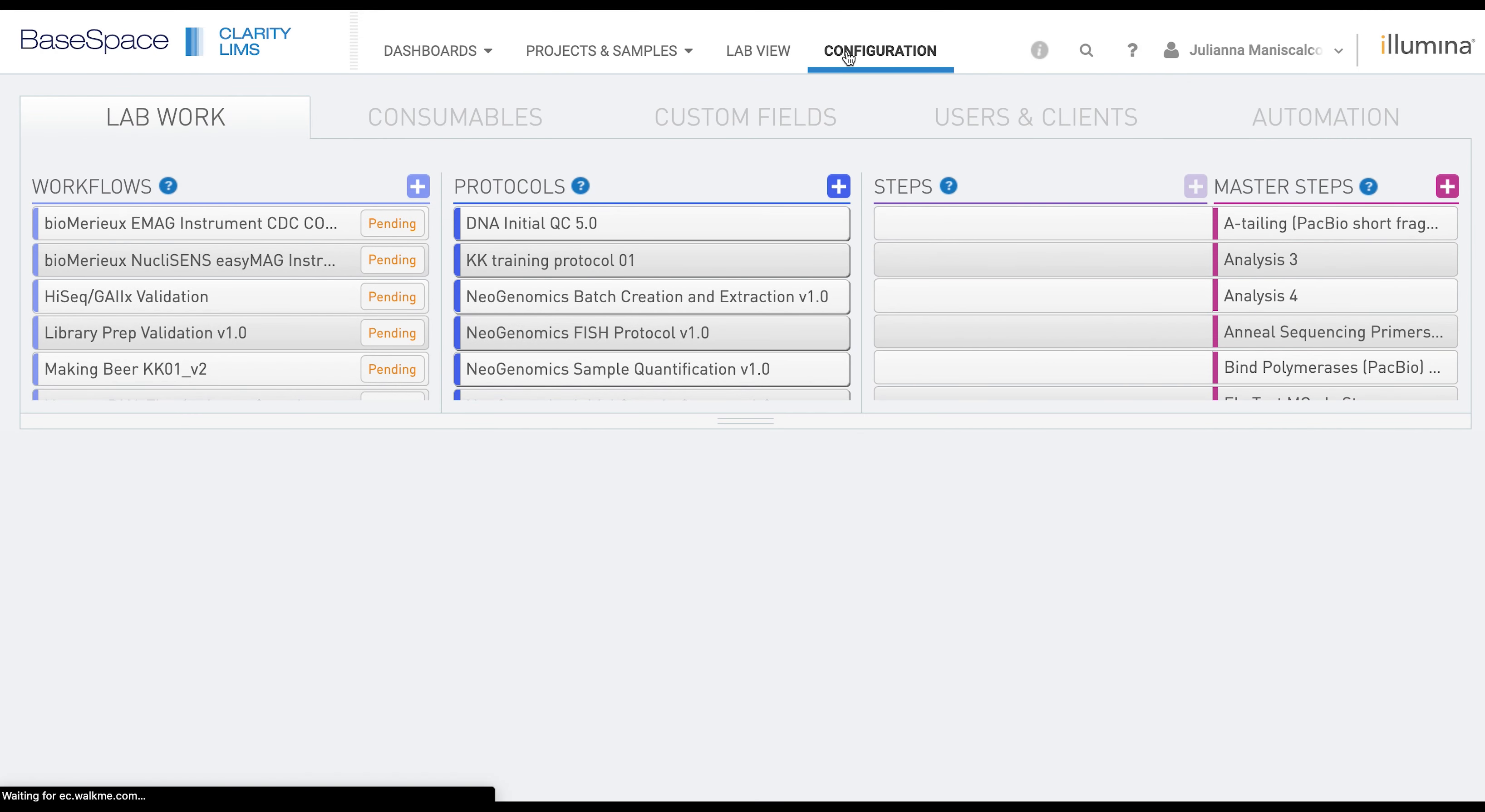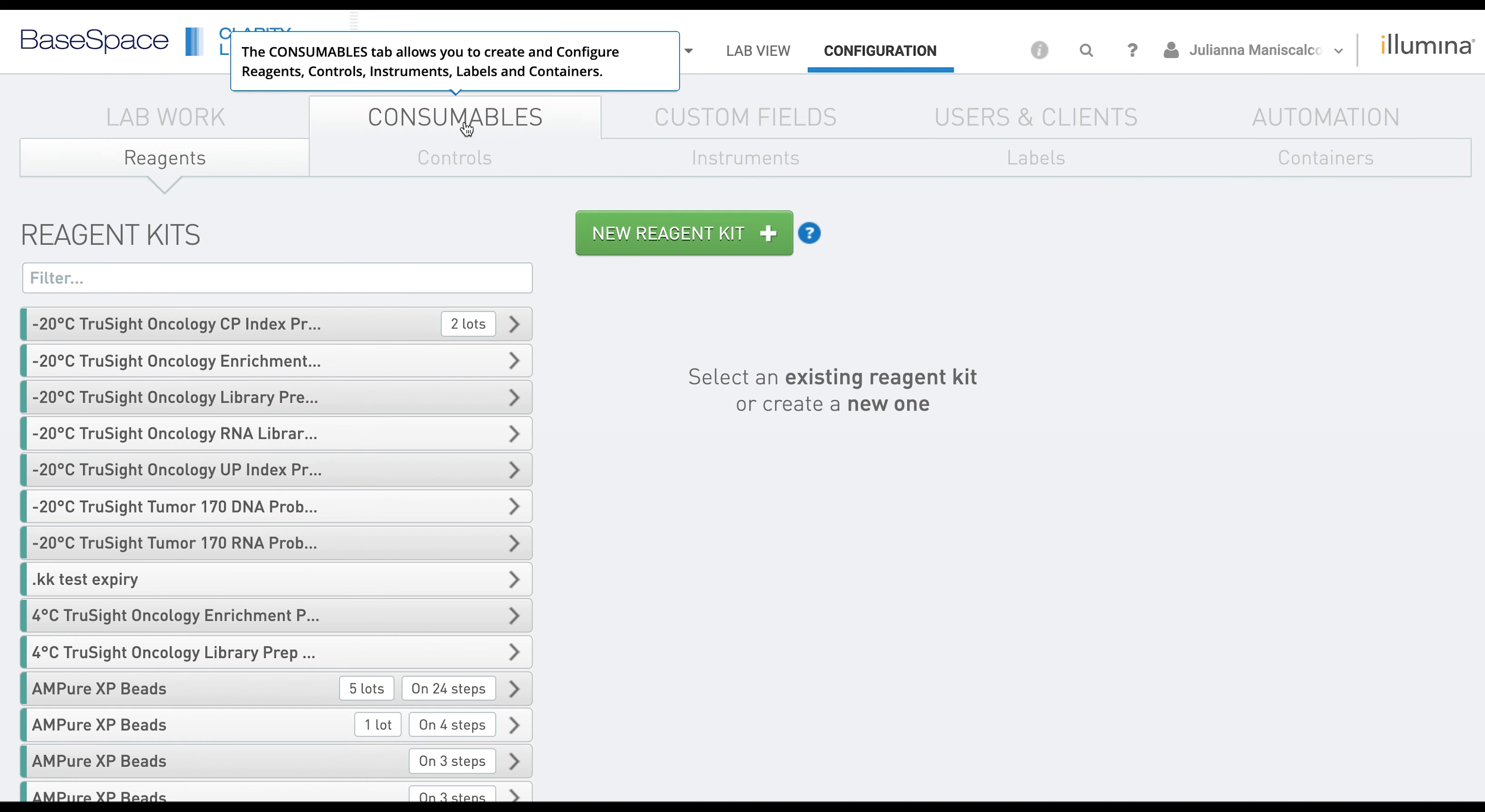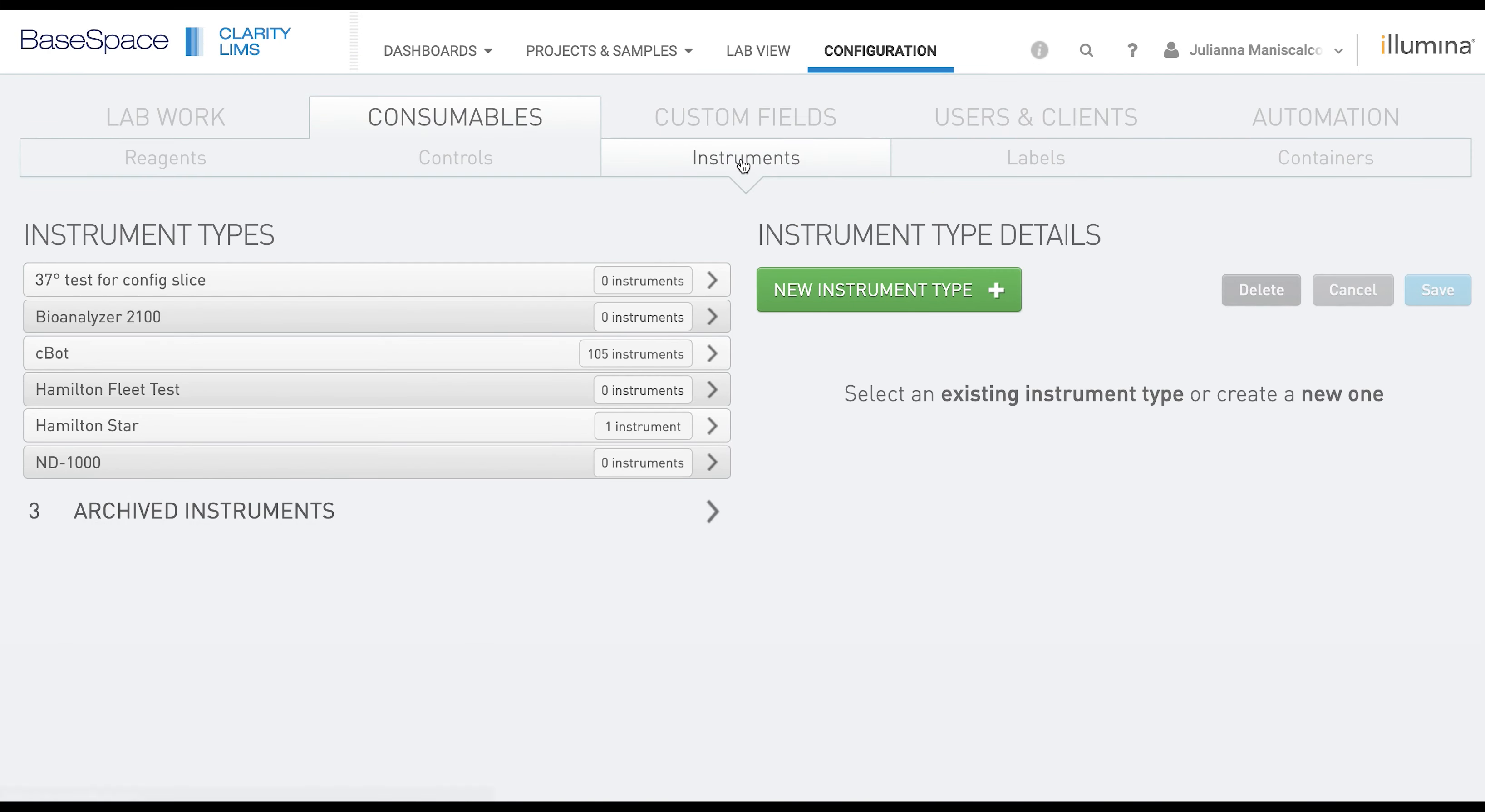If you click on Configuration, then Consumables, and then Instruments, this will be the space that we configure the instrument type. To add the new instrument type, you will click the green New Instrument Type button.